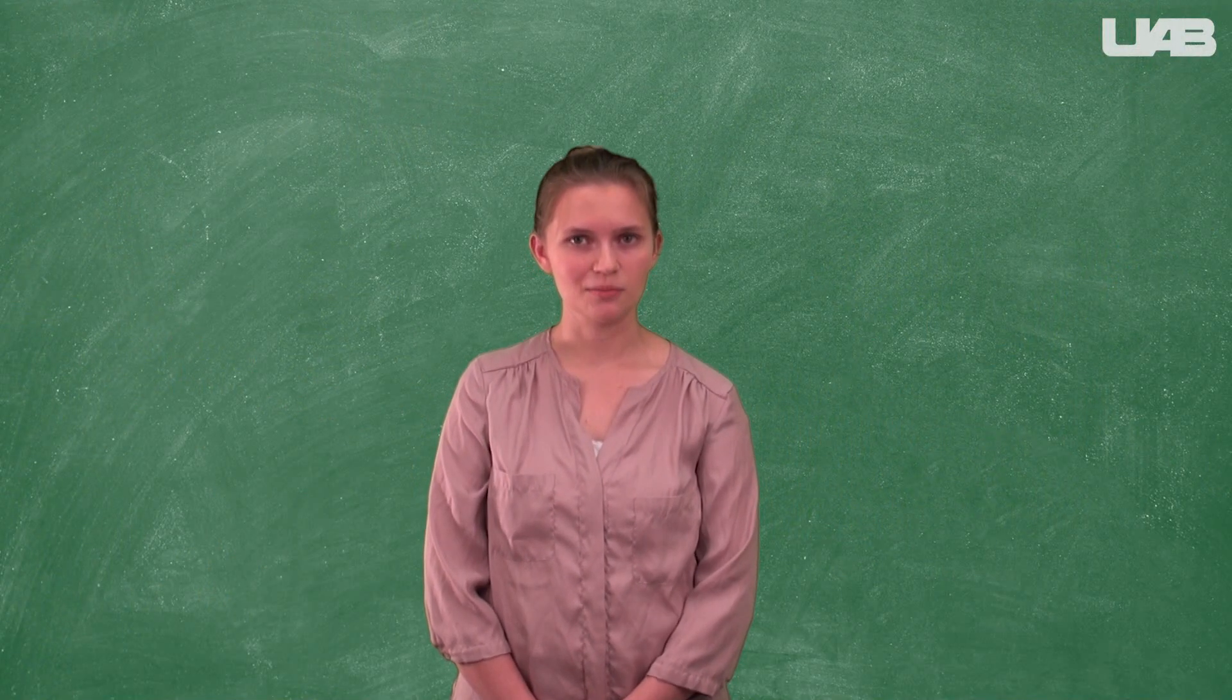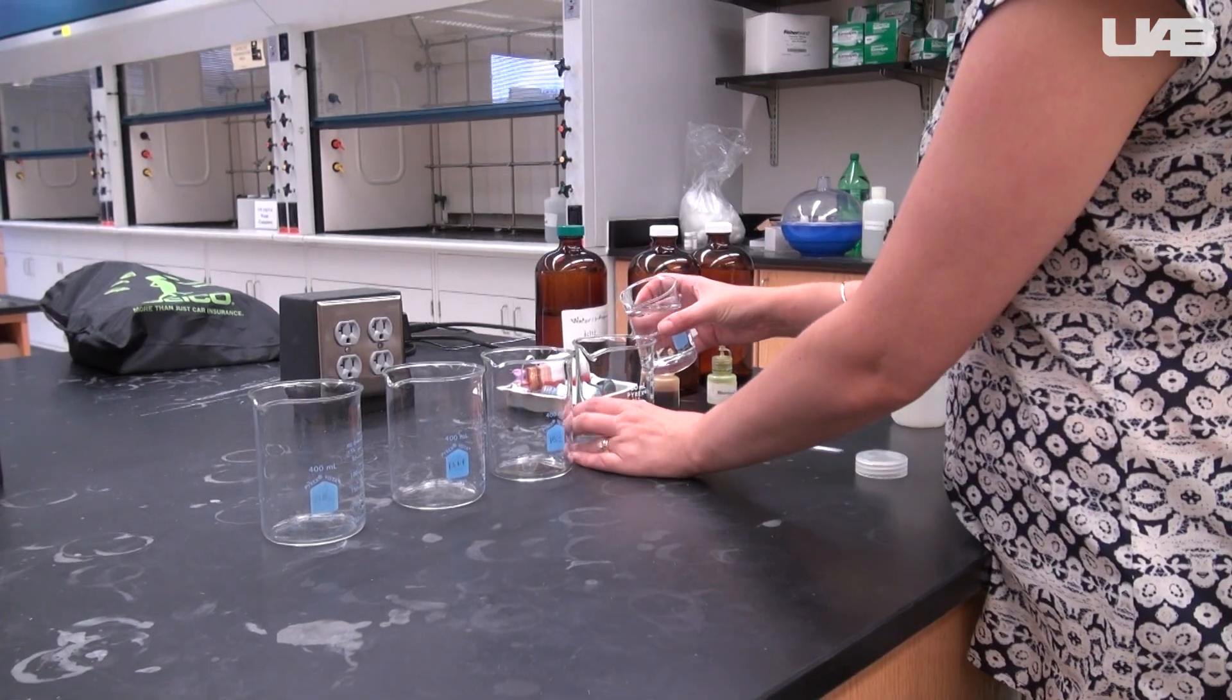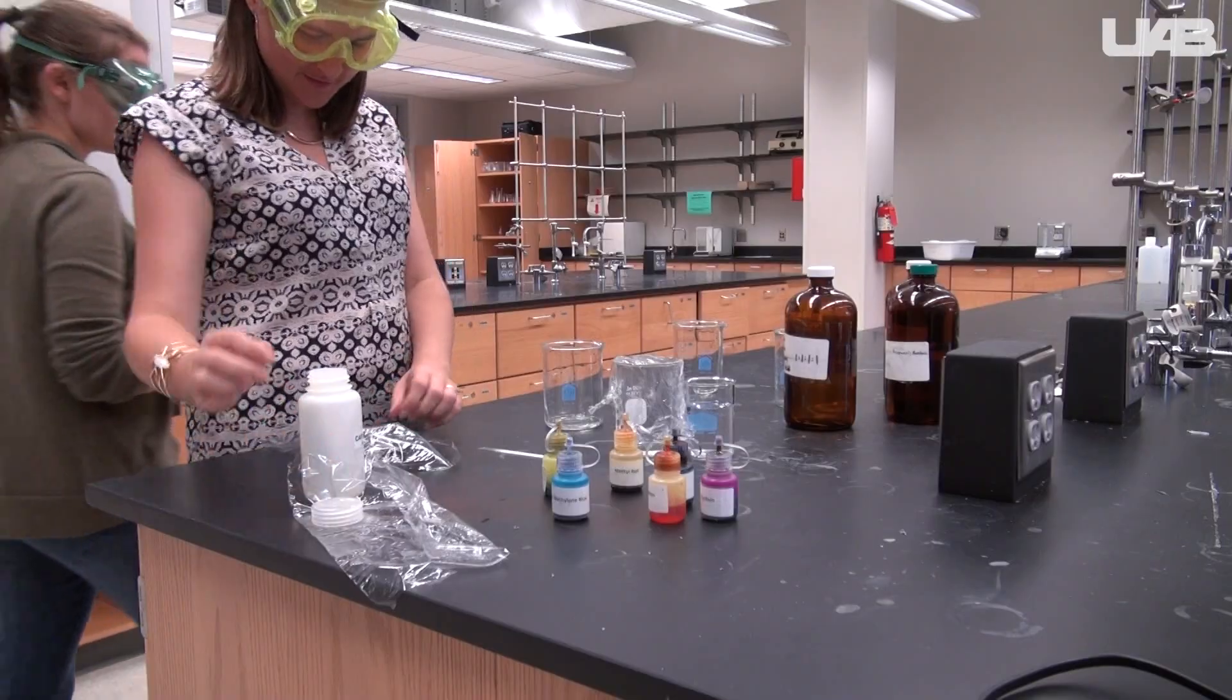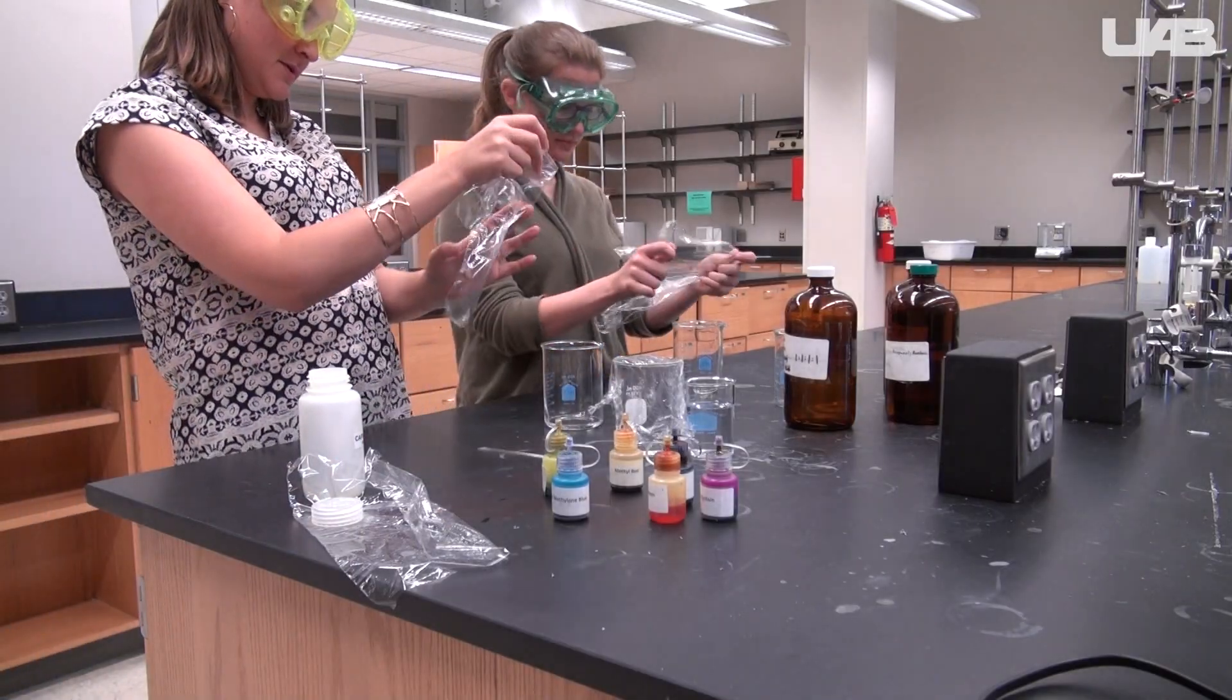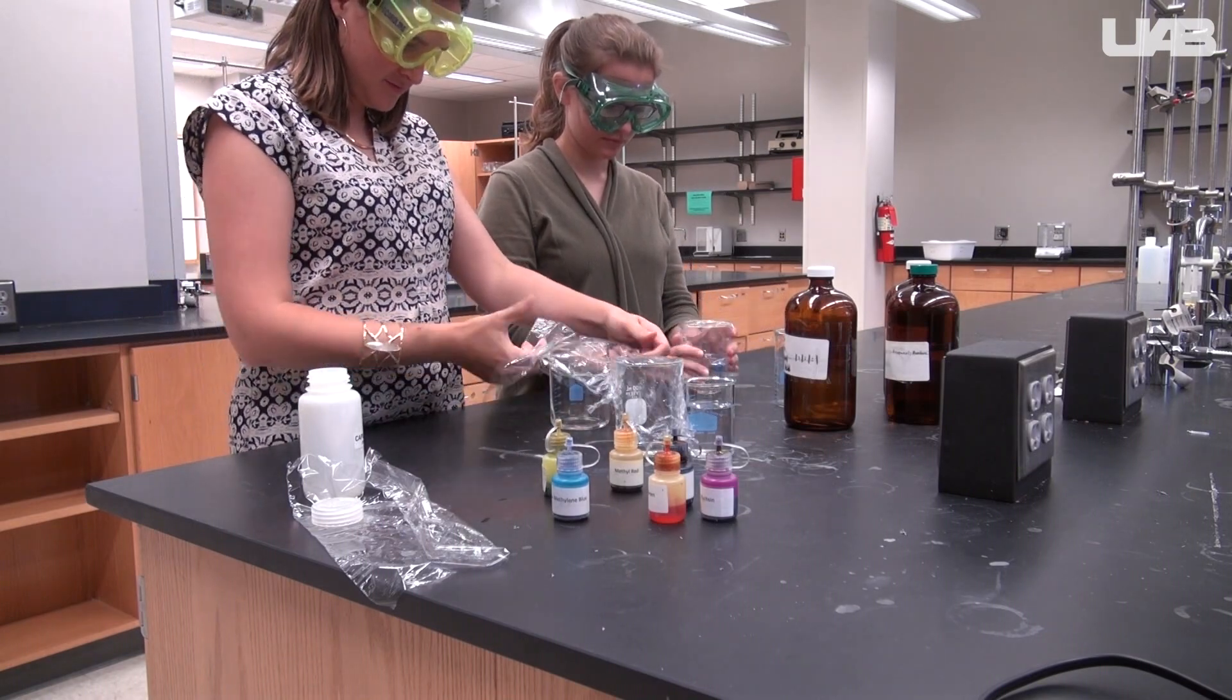Begin by setting up your solvent chambers. Each group will prepare four TLC plates, so you will need four solvent chambers. Add one solvent to each of the four beakers. You don't need very much. Cover each beaker with cellophane or plastic wrap.